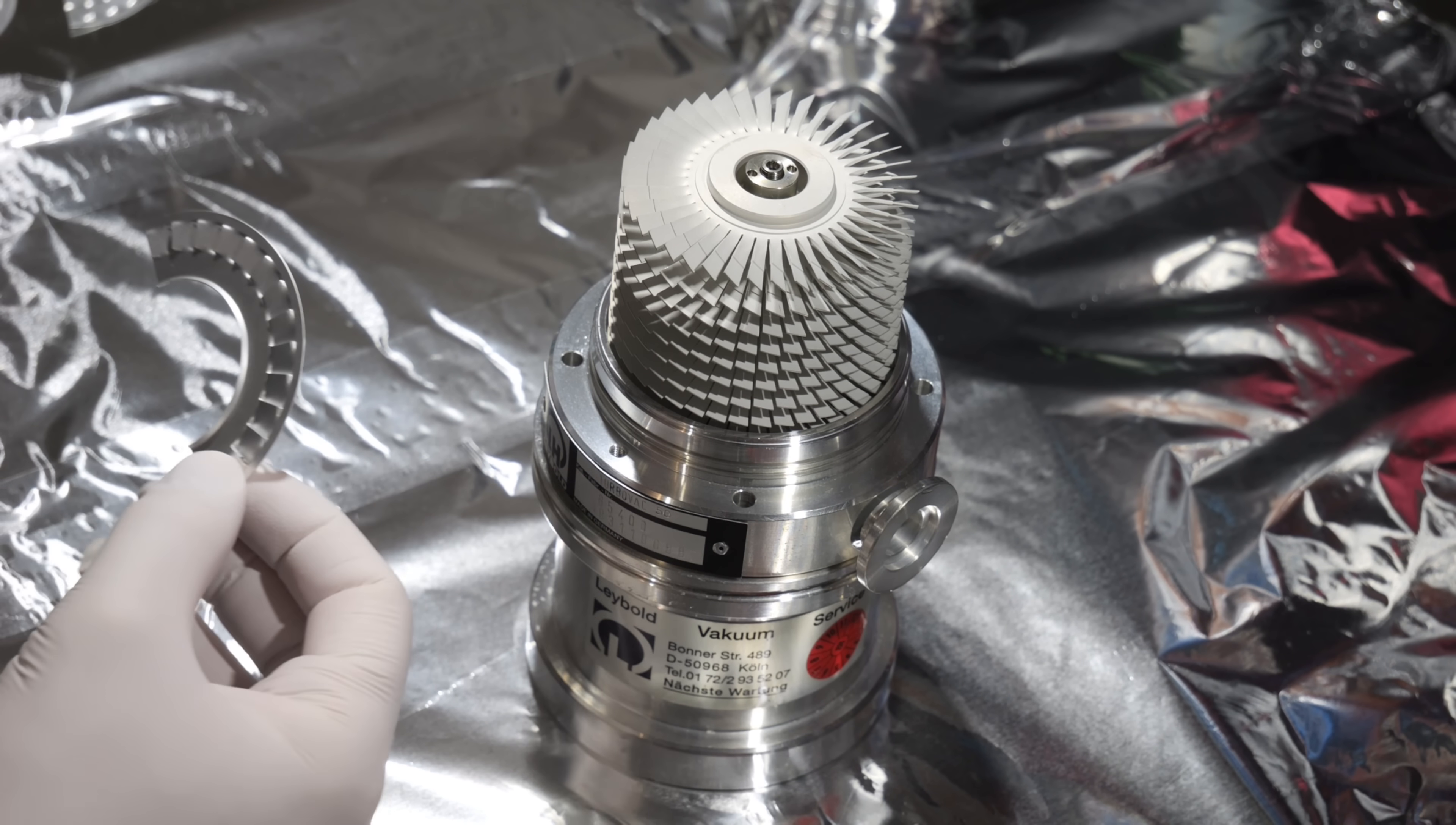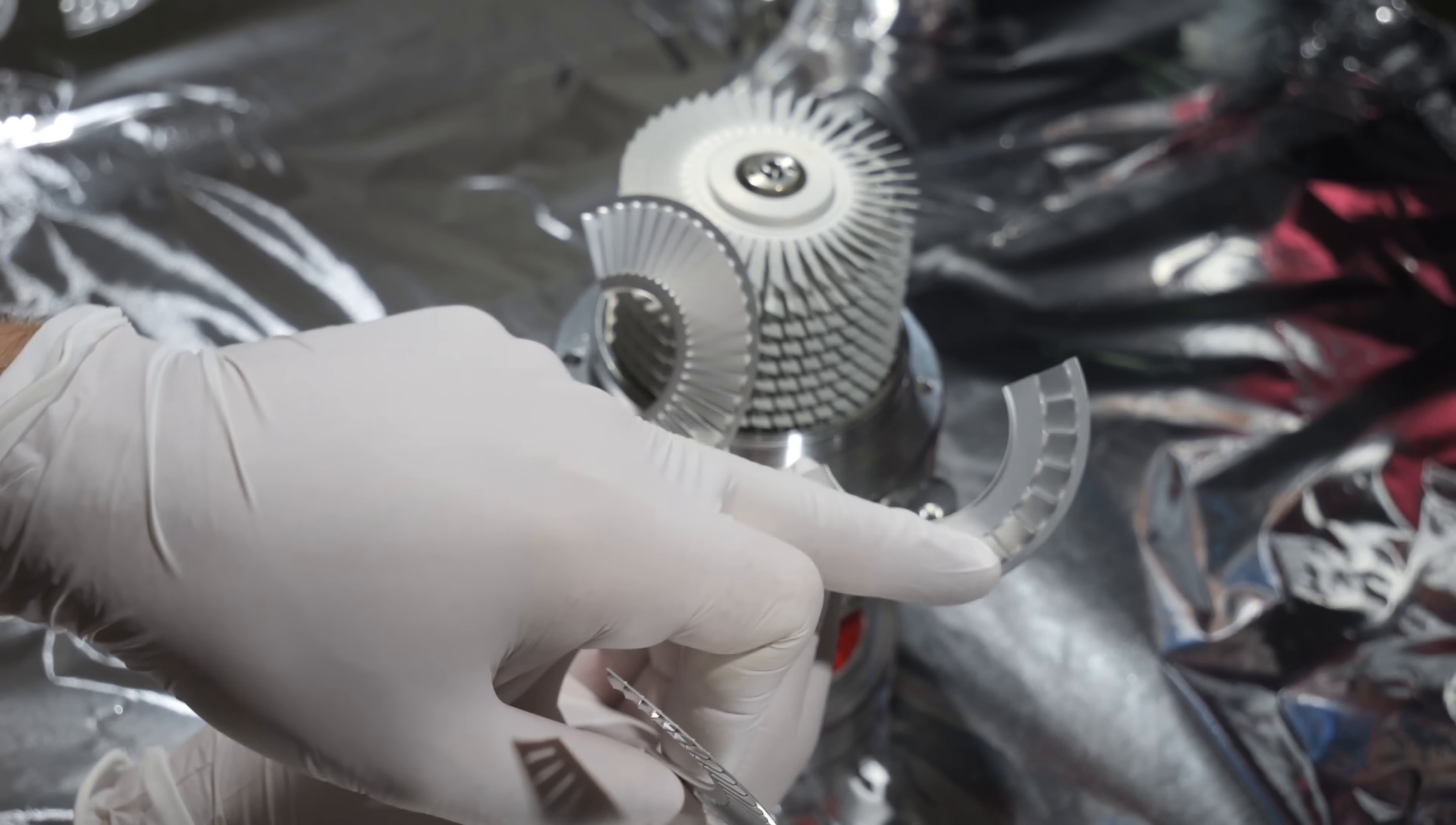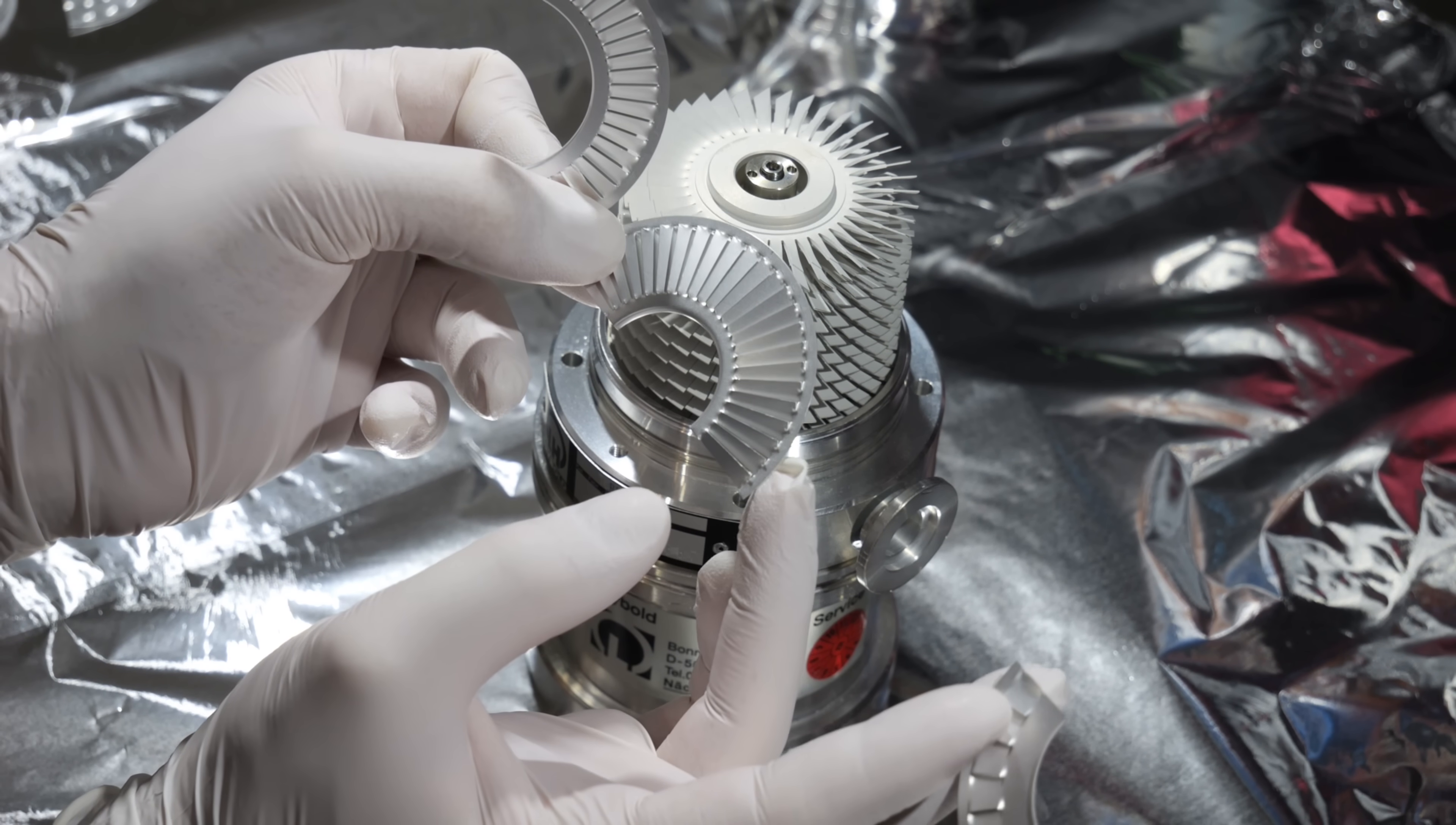There are three different types of stators. These three types here. The one on the right are the ones that go on the bottom. This one here is the middle area and this type of stator here is on the top.